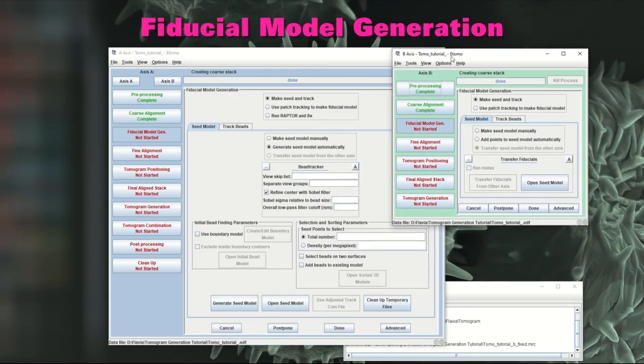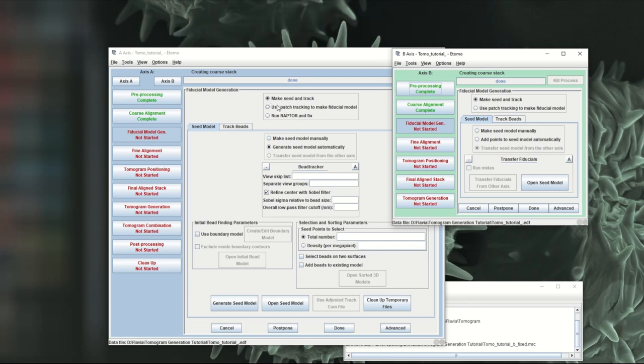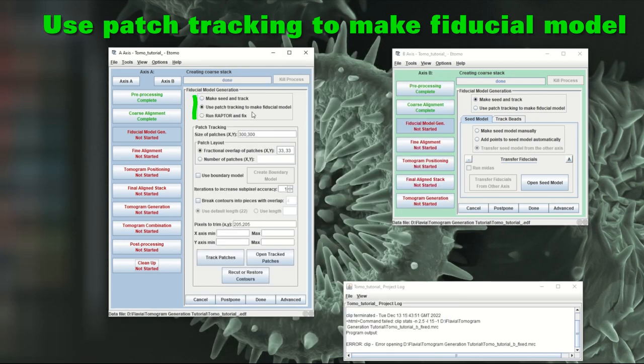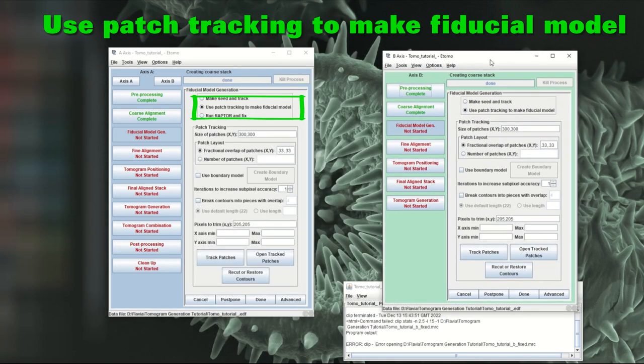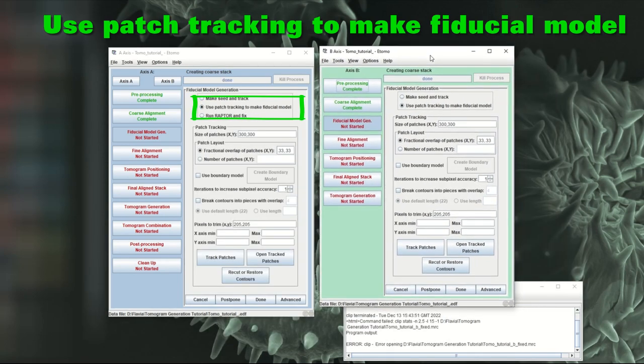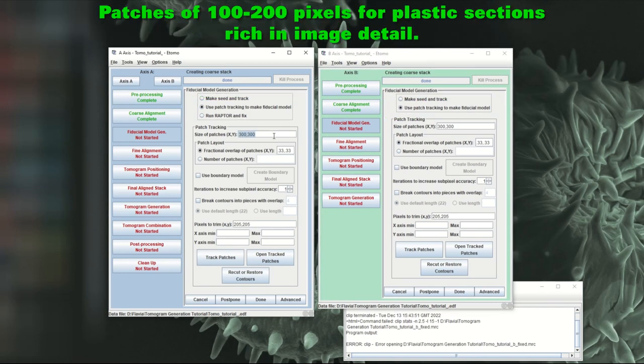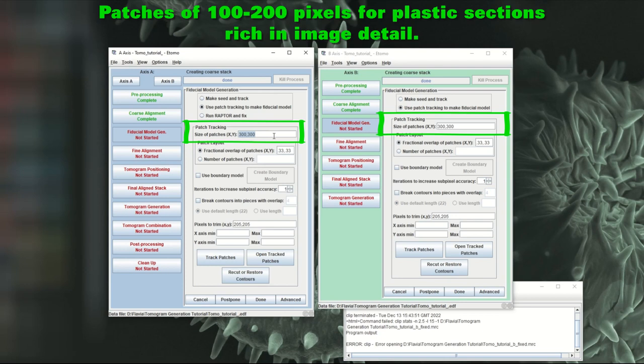So we then move on to the fiducial model generation. We do not have gold fiducial so we can't use make seed and track. So we use patch tracking. And here patch tracking again. For the patches, because this is plastic sections, you should use something up to 200 patches of up to 200 pixels. So I'm going to say 190, 190 for both of them.